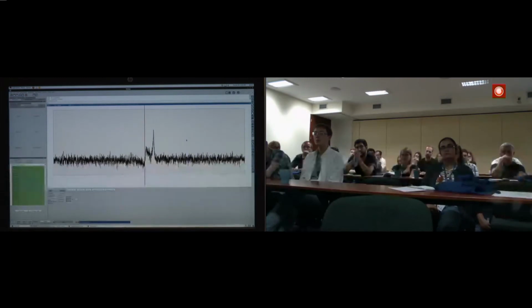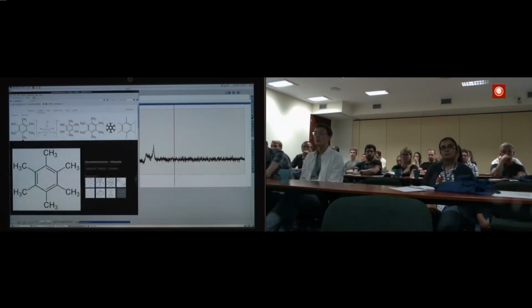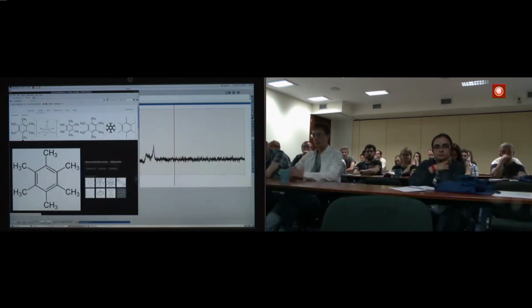And as you can see, this spectrum is not clear. Its quality is, let's say, not satisfactory at all. However, let me just show you once more the structure of that molecule. We can instantly see that there are, at least in this case, only two inequivalent positions of carbons. One residing in this methyl group over here, and the second one, the carbon residing in the phenyl ring.